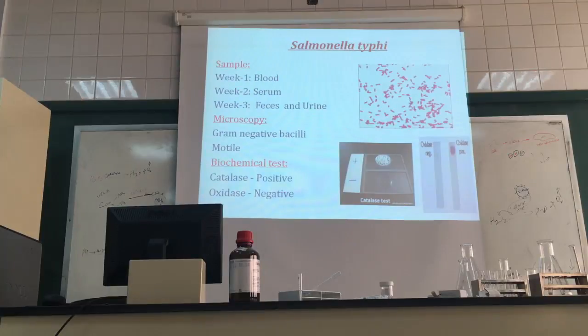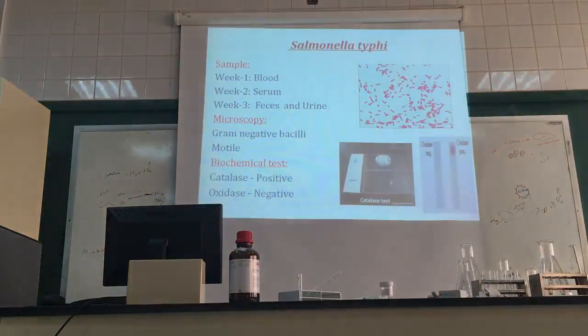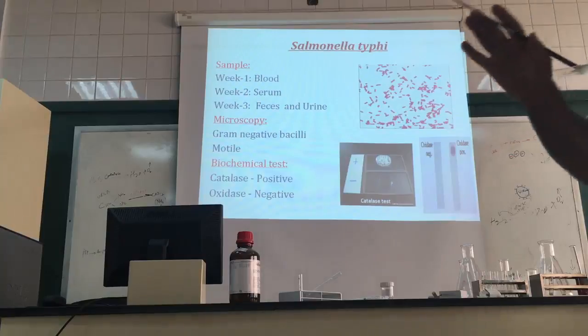Once it is red hot, finish. There is no bacteria at all. It's over. So now you see here bubbles are coming out because the colony of the bacteria is situated here. This means the bacteria has interacted with the hydrogen peroxide. What is the job of hydrogen peroxide? Hydrogen peroxide destroys the cells.